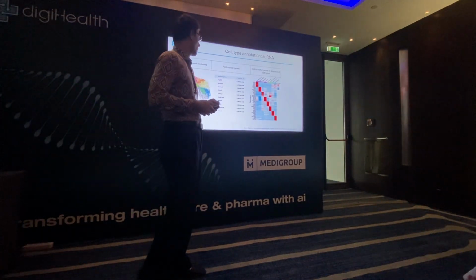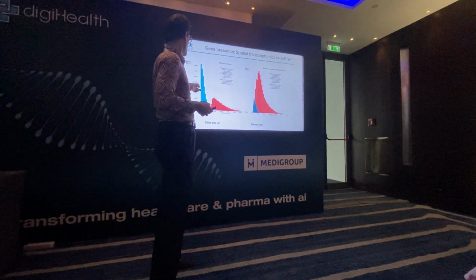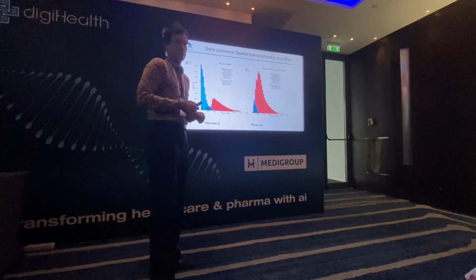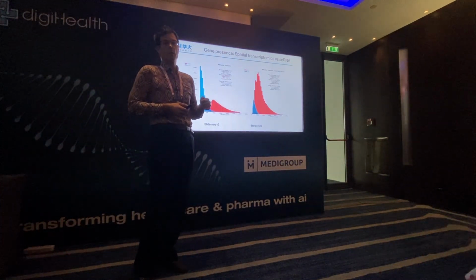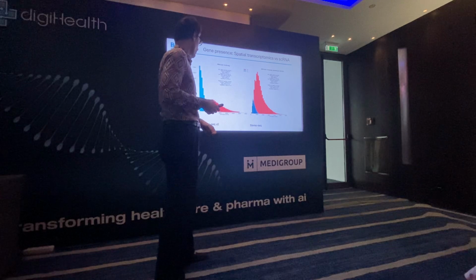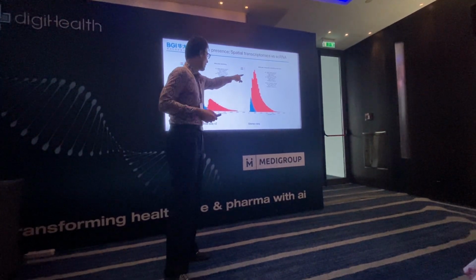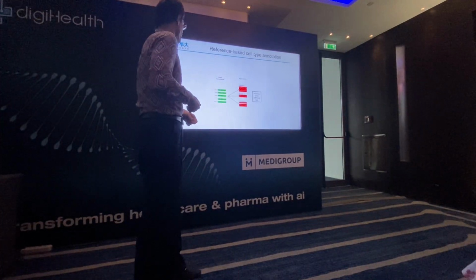Because of that, this is just an example comparison of the number of genes in the cell, comparing single cell technologies and spatial transcriptomics. With single cell marked here in red, with these two samples belonging to different technologies, we can see that we have a much higher number of genes inside each cell.